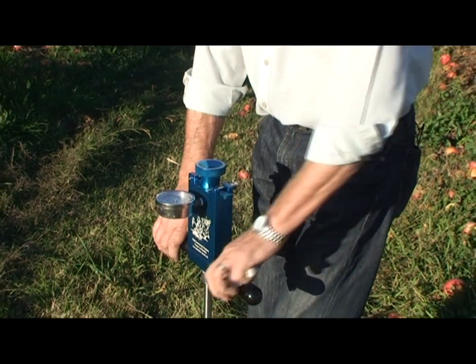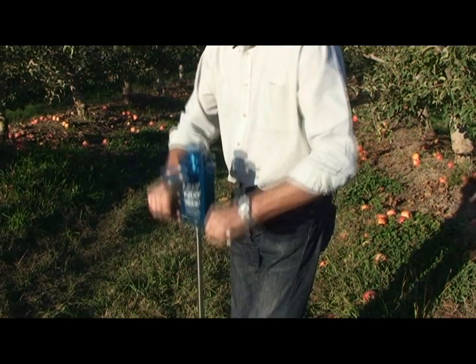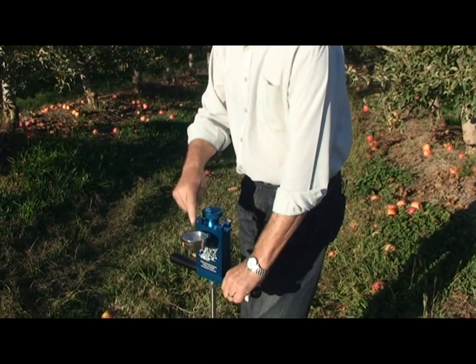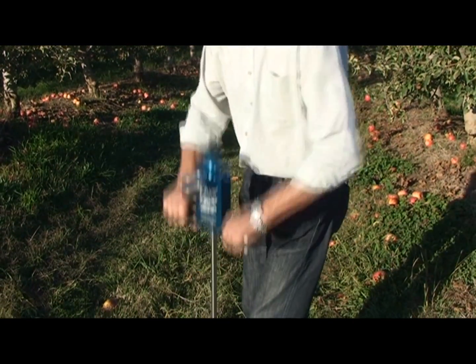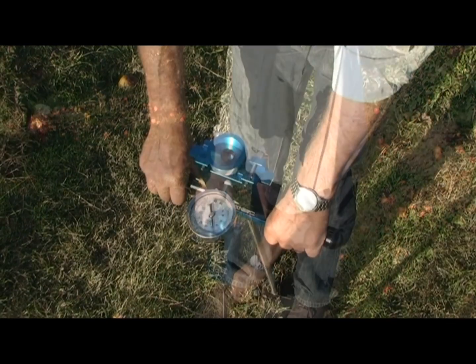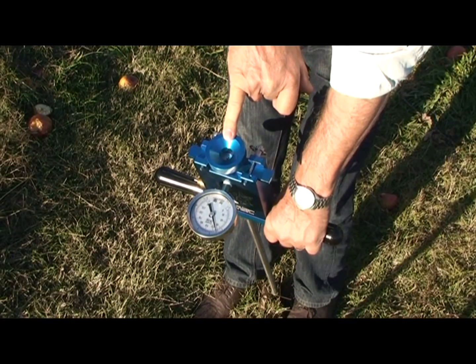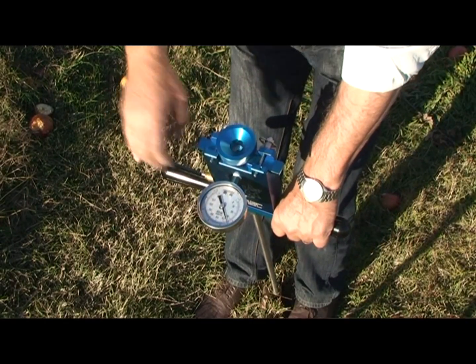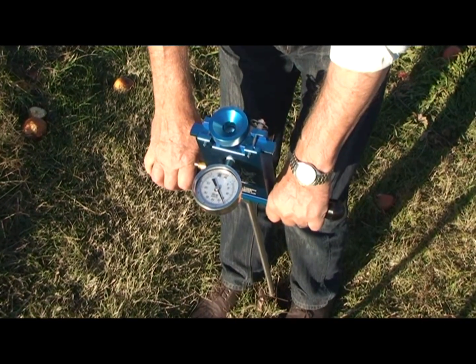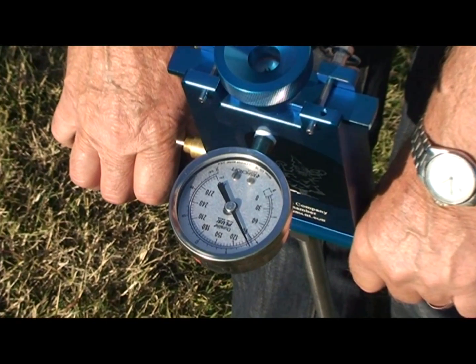Then we pump the chamber, and when we see sap coming from the end of the cut leaf stem, we take a reading on the pressure gauge. That tells us the water status of the tree, or how tightly water is held within the tree.